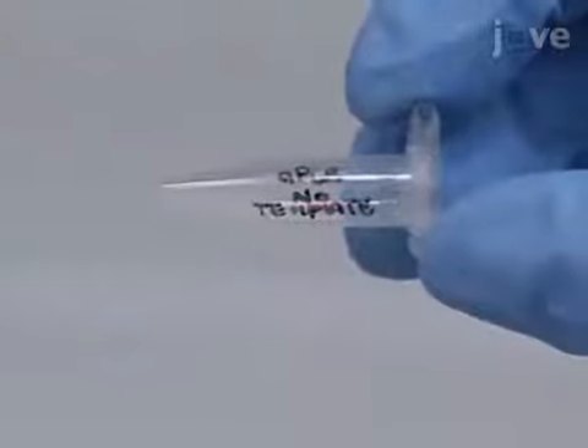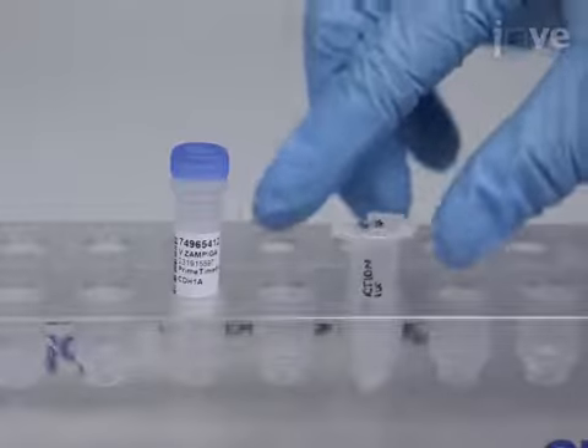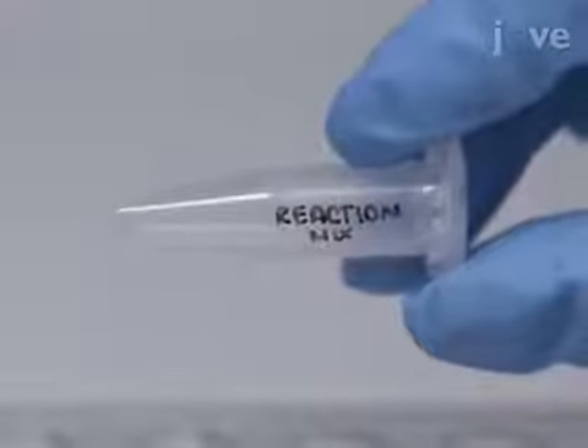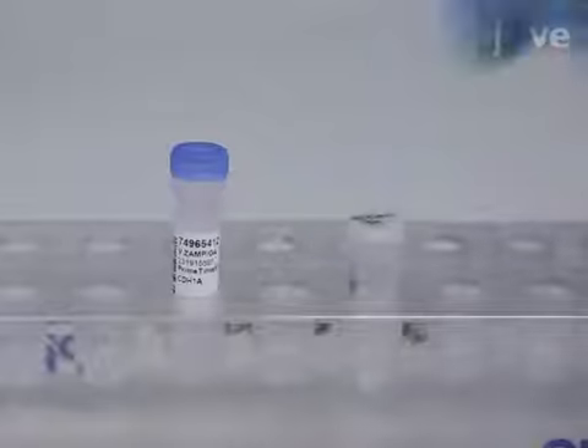Also, make a no-template control tube. Next, gently vortex the master mix and aliquot 8.7 microliters per reaction into a sterile tube.